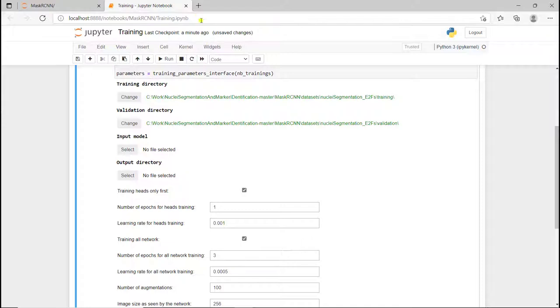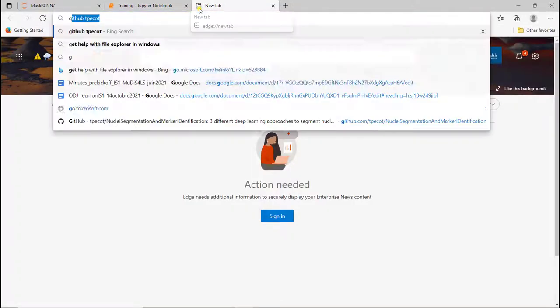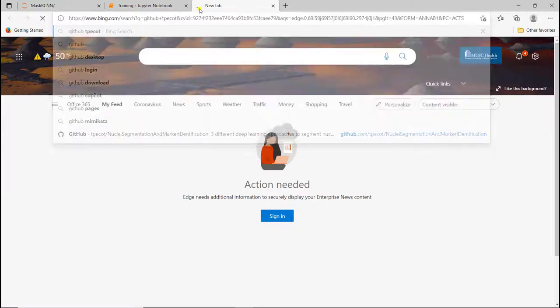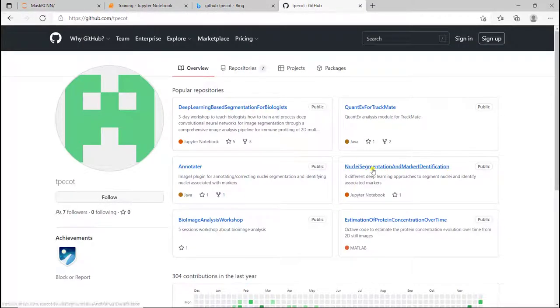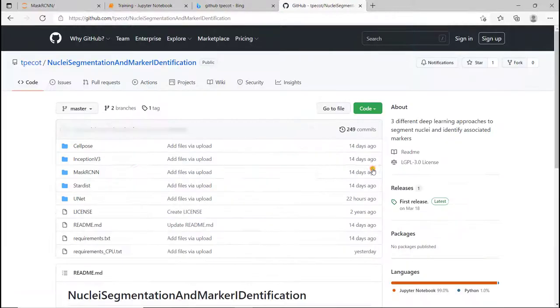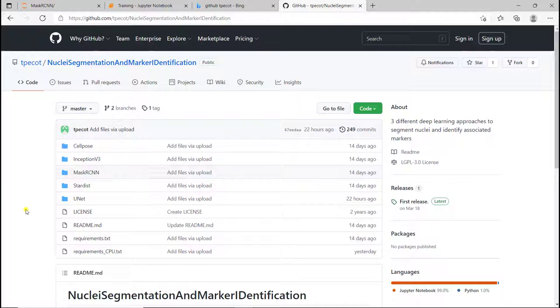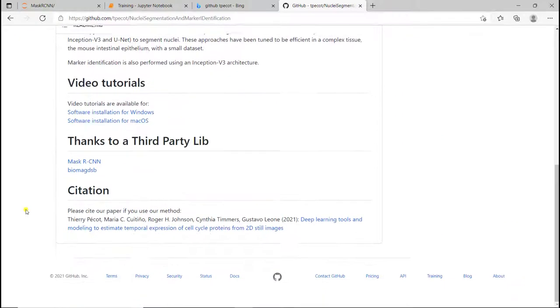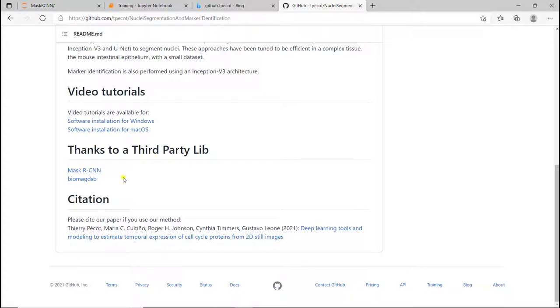To do that, we're going to go back to the GitHub directory. If you go to nuclear segmentation and marker ID notification, where we downloaded all the codes, we can go down and here for third-party libraries, we have Mask R-CNN. So it's the code that's been defined by the people that designed the Mask R-CNN method. And there's Biomag DSB. I'm going to click on that.